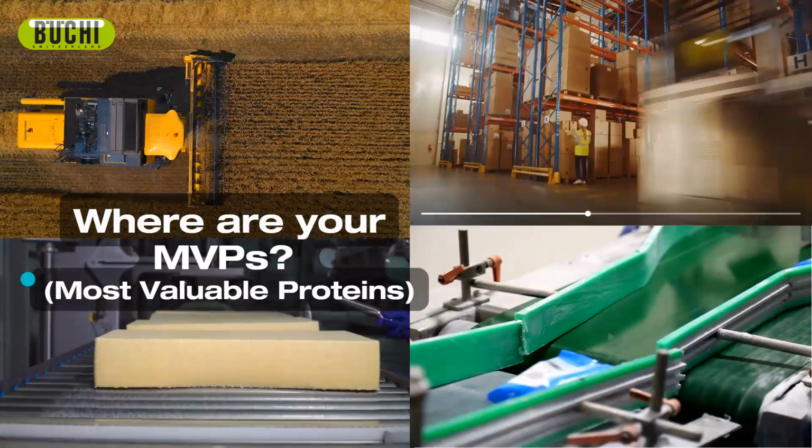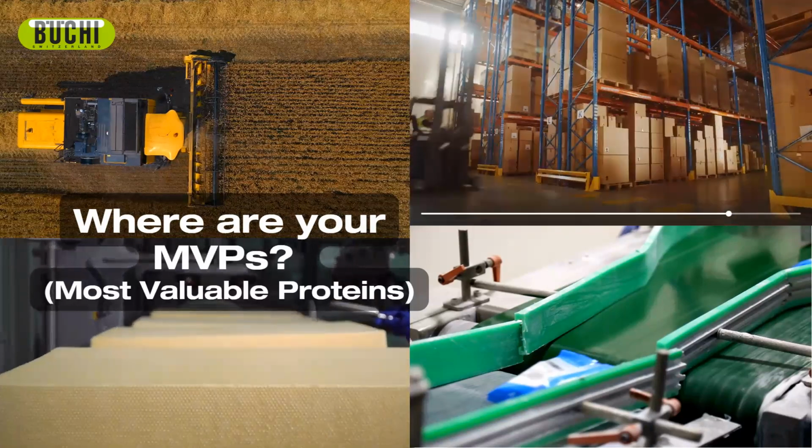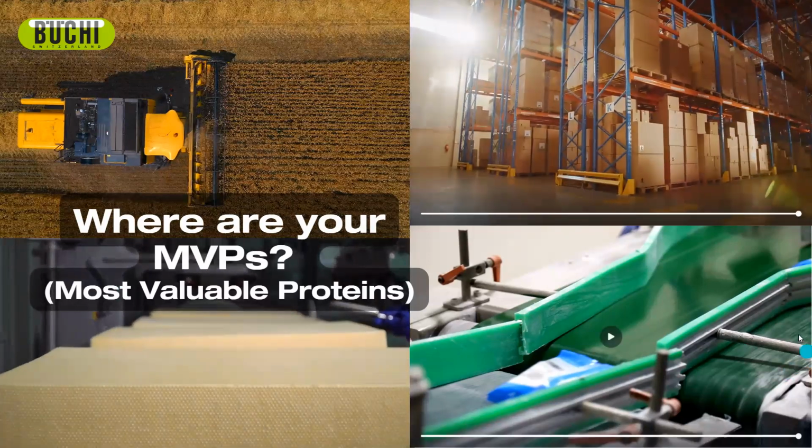And I'm sure everyone listening knows where their pain points are, as far as, okay, it is most critical for me to know protein here because I've either had failure or I've had to redo work. There's all these things that can go into it. So knowing where it affects you the most, that's where you can start to say, this would be a great spot to analyze protein. But you can do it at all the sites.